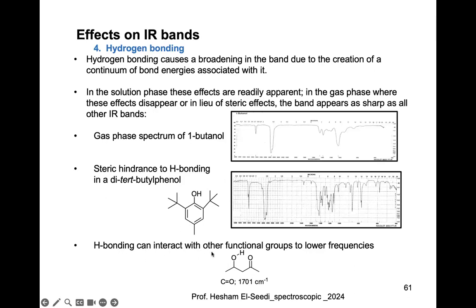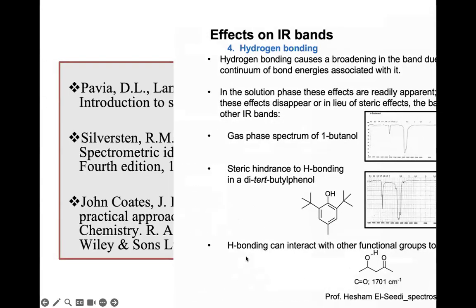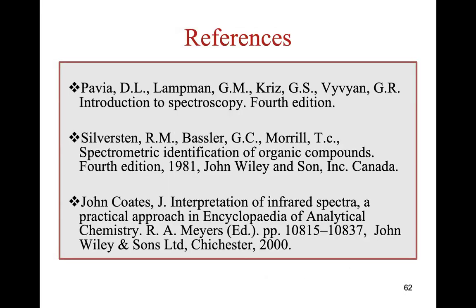Hydrogen bonding can also interact with other functional groups at lower frequency, like in this case the carbonyl group here and the OH, which make hydrogen bonding. And these are the references you can see.